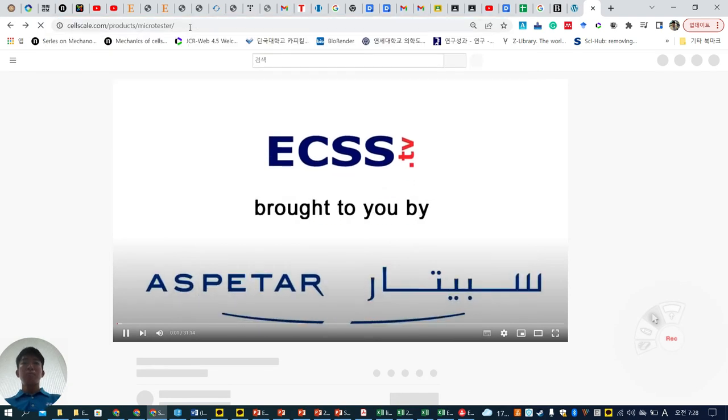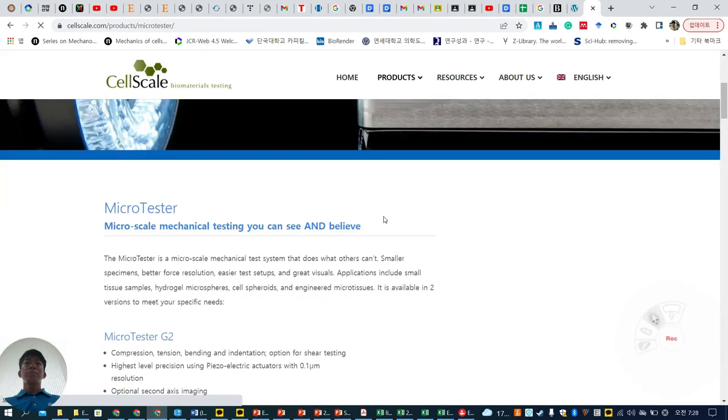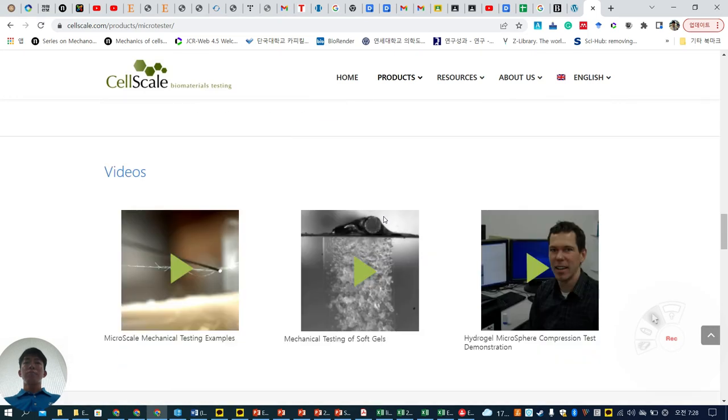10 나노뉴턴이면 레졸루션이 10 나노뉴턴이잖아. 네. 그럼 티슈 레벨인 거지. 티슈 레벨 좀. 멀티셀 레벨. 한 서버 나노뉴턴으로 가면 이제 싱글셀 레벨로. 그죠? 예.